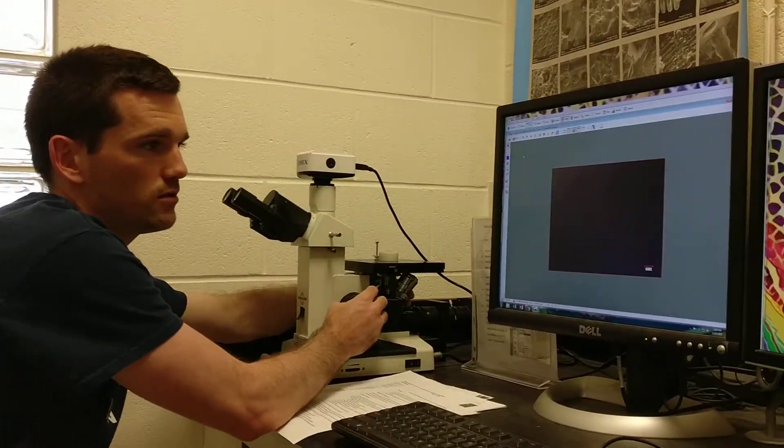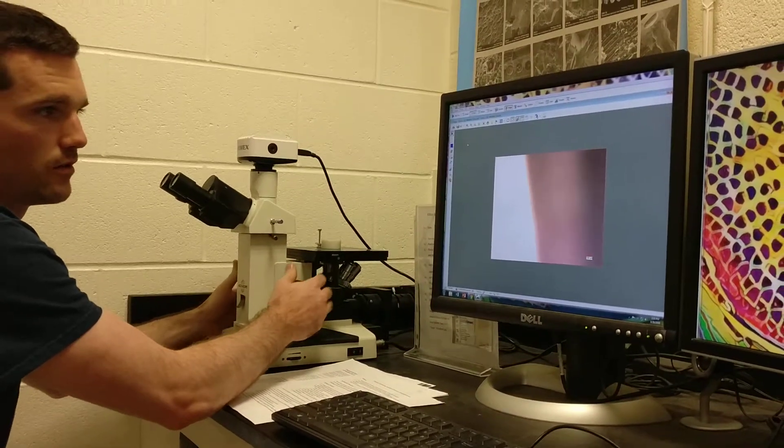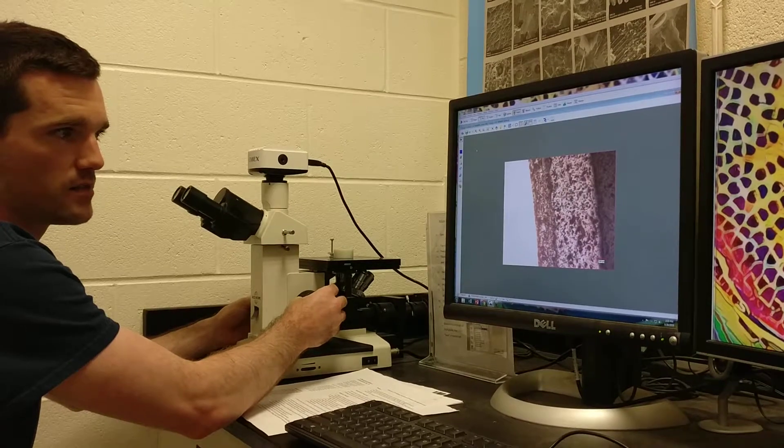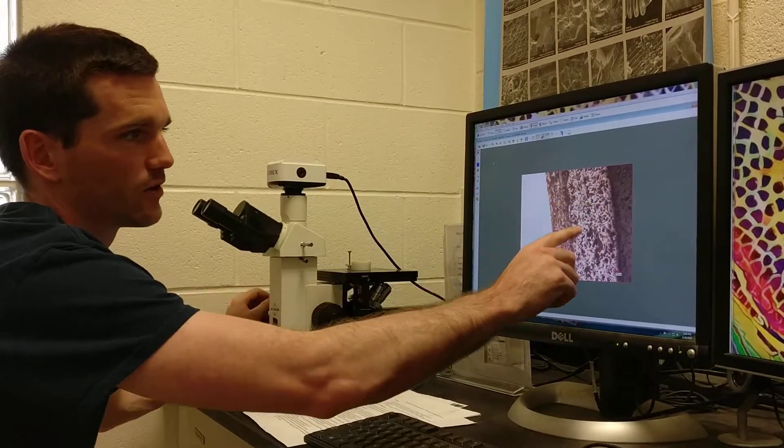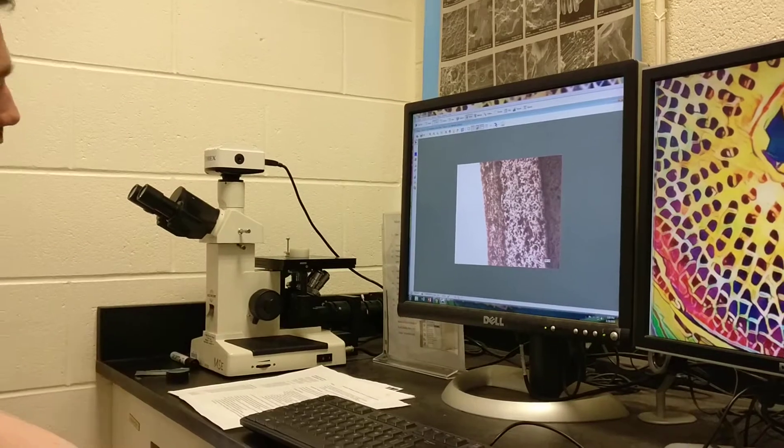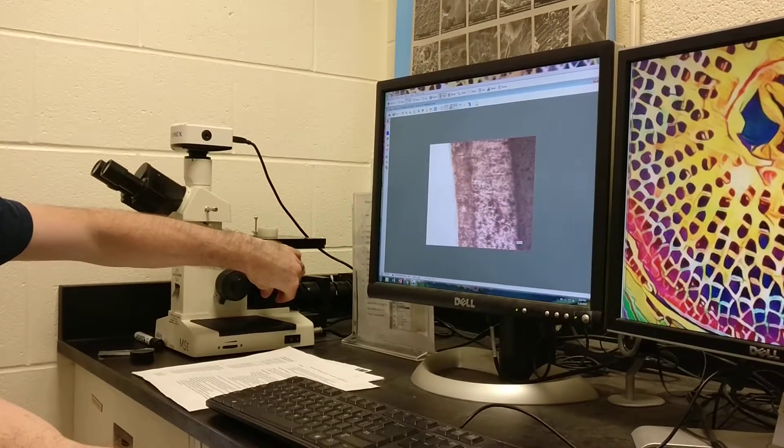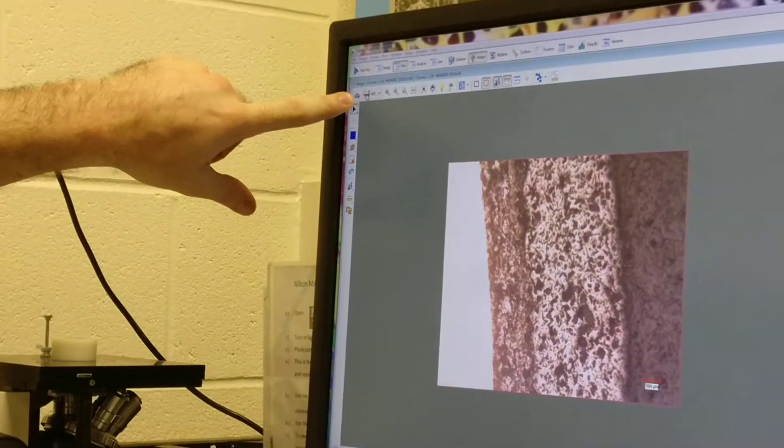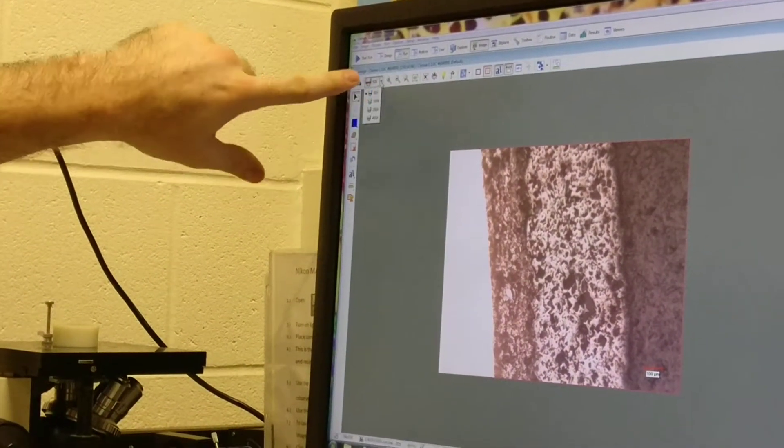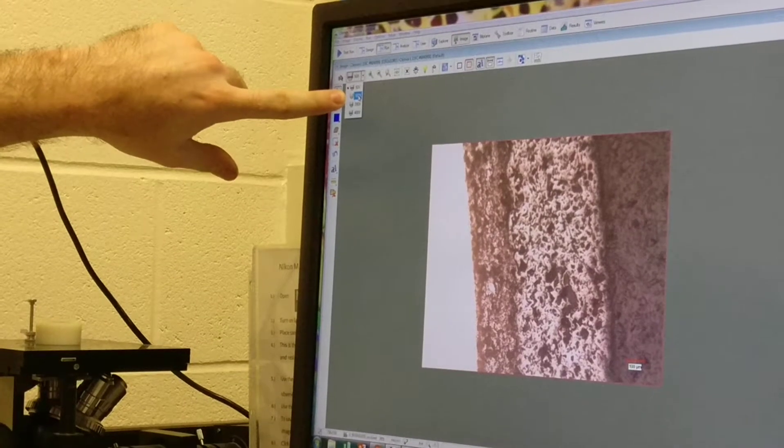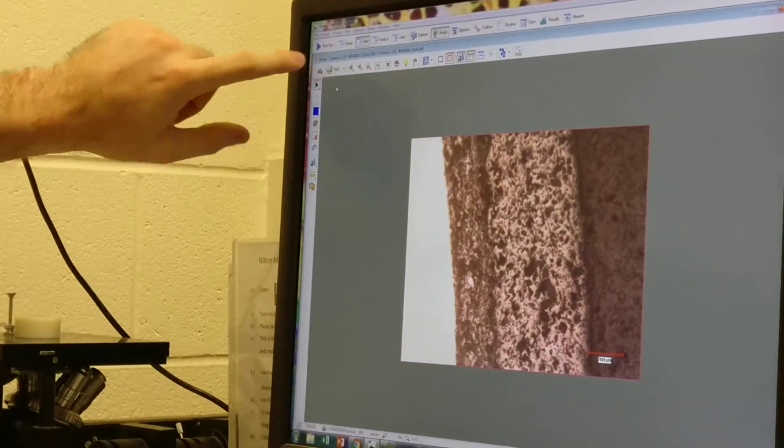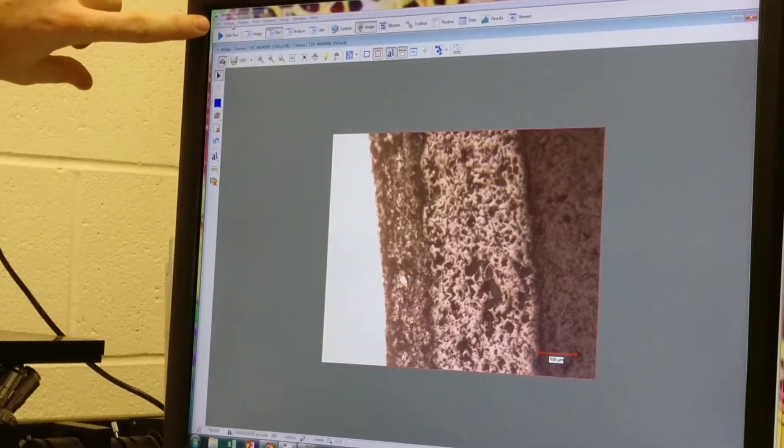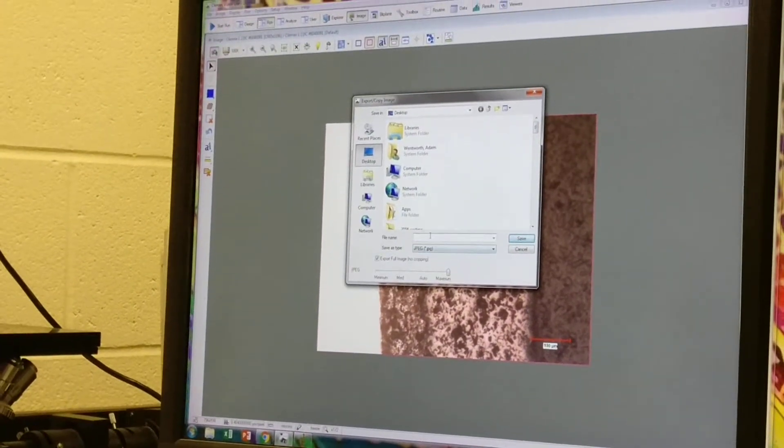In order to do that we should go to a higher magnification, switch over to 100x, roll the fine focus forward. I'll show you how to get the porosity of this outer layer here. First we're going to capture that image by clicking the freeze button. We're going to drop this objective lens down and choose the 100x. We're going to click the camera icon to freeze it and click image export and we'll throw it on the desktop.